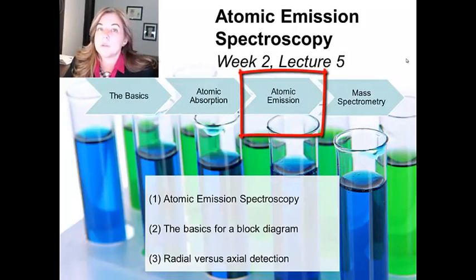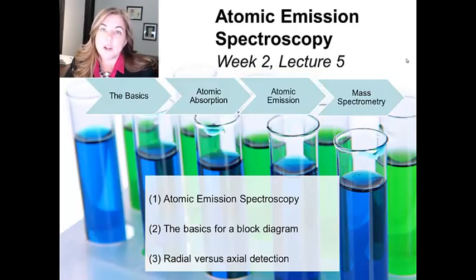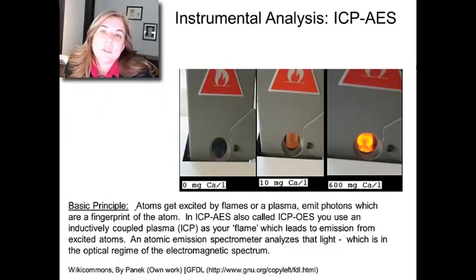There's a companion demo, so this is going to be a pretty brief lecture, just saying some of the highlights, and definitely do the reading, because I'm really counting on you going through that to learn a lot of the facts. So I love this picture because I think it really captures in a very graphical way what goes on inside of an atomic emission spectrometer.